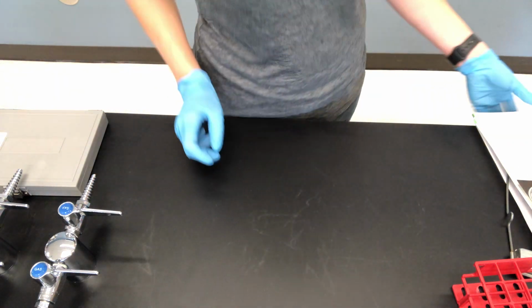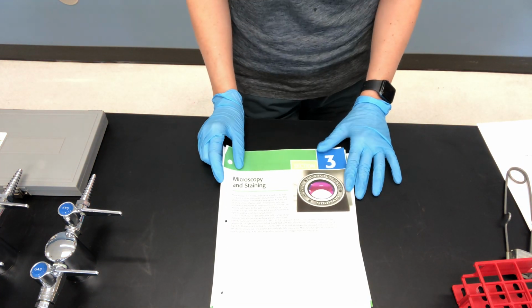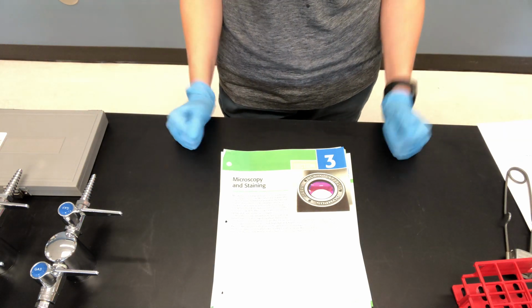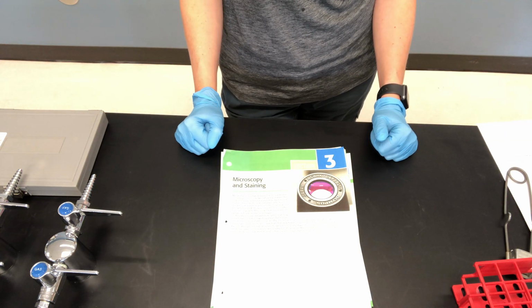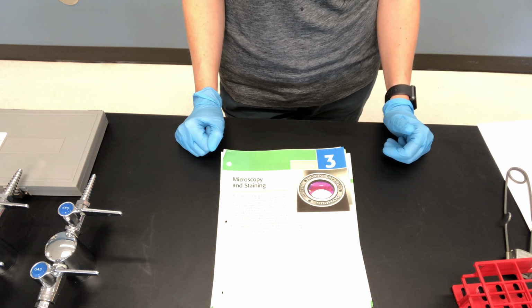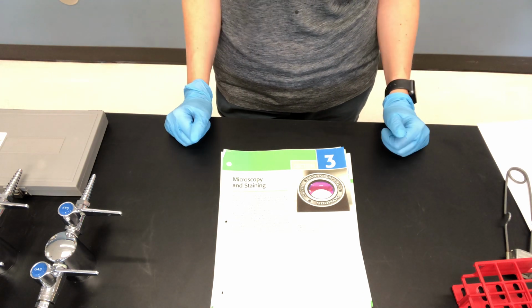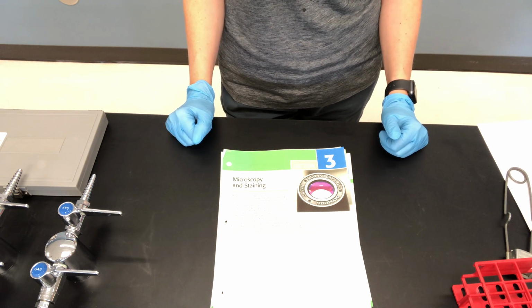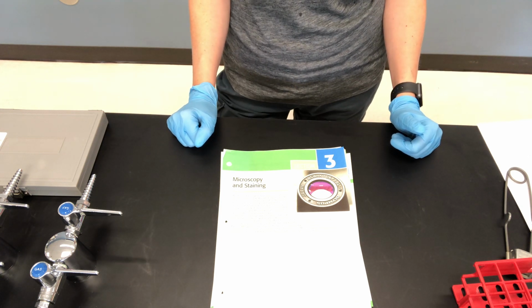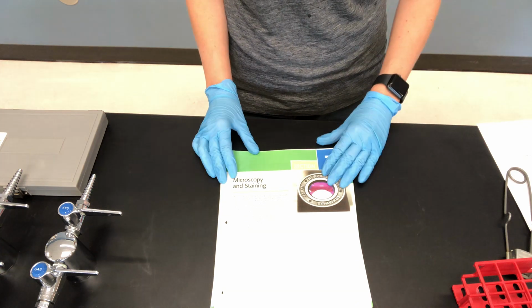So there's quite a few sections in your lab manual dealing with microscopy. I'm using these labs to help students learn how to use a microscope if they've never used it before, especially coming off of some of these COVID science labs. You may not have got that in person. Or refreshing if it's been a while since you've used a microscope. And then also a technique that we don't teach in any other class except for microbiology is oil immersion. So I'm going to show you how to do that as well.